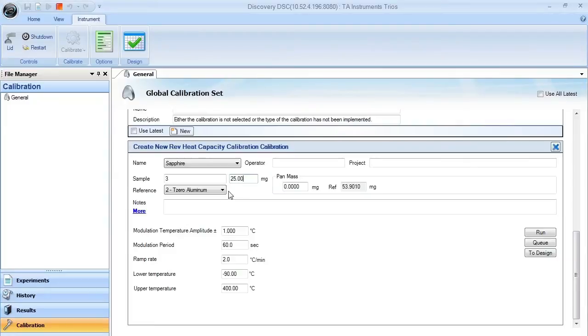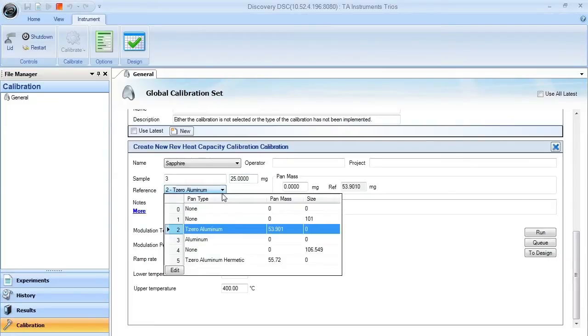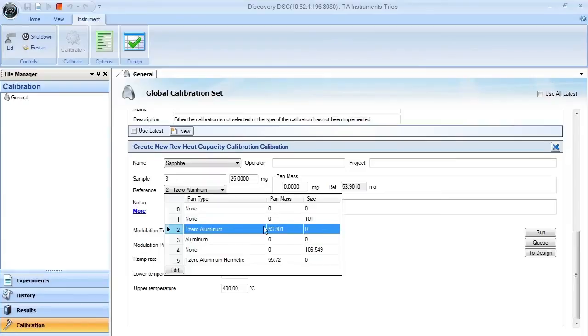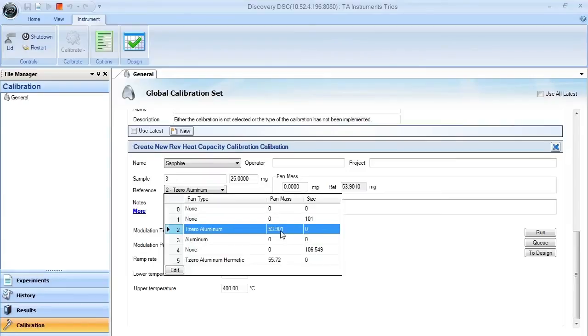Make sure that you choose the correct reference pan. In this case, T0 aluminum in selection spot number two, with a pan mass of about 53.9 milligrams.